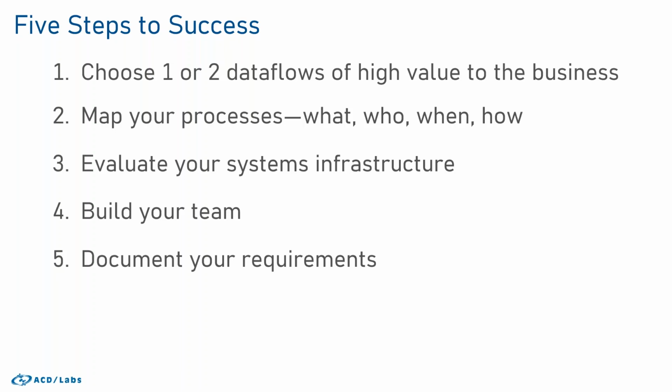And how do they want that data to be presented? Do they need an interface that allows them to process and interrogate that data? Or do they need access to the process results so that they can abstract that data. Evaluate your systems and infrastructure, right? What are the systems in place? What are the instruments, software? What are your other systems in terms of ELNs and other systems that you need to integrate to?